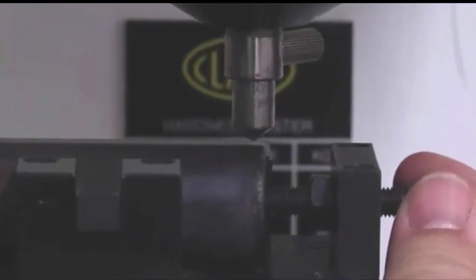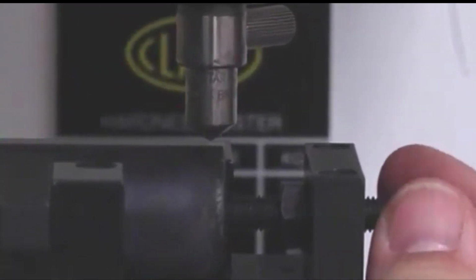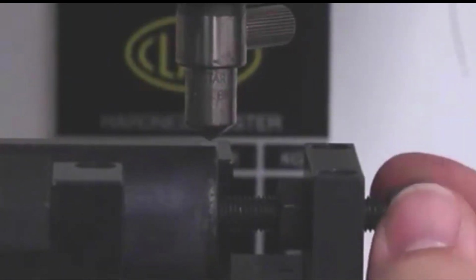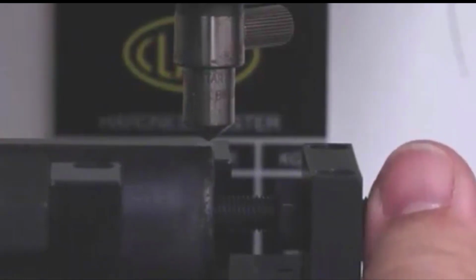Now I'm going to use this screw on the right, and I'm going to use that to adjust the end of the bar to set the 0 point. And I want to get it so that the indenter and its reflection basically match. All right, so that the indenter tip is right at the end of the bar. Okay, so we've got the indenter tip lined up exactly with the end of the bar.